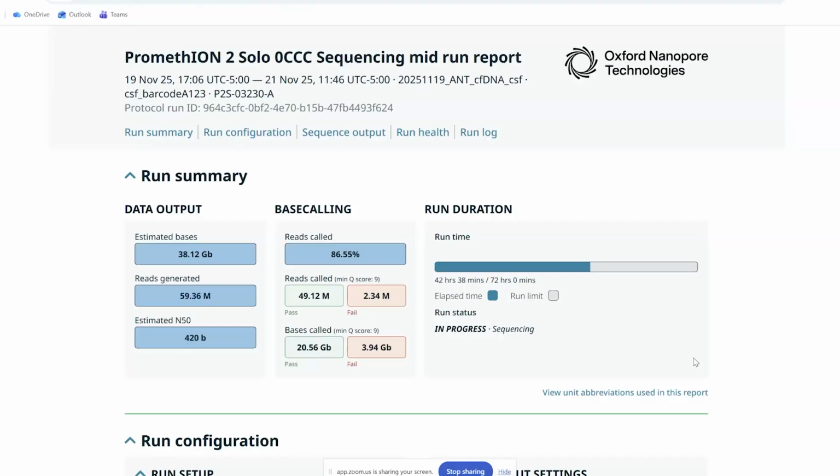But FASTQ is pretty simple and straightforward for concatenation if that's what you're using. You can do it from the command line. You can use FastCat, or you can just use the workflow's ability to concatenate things instead. So you can give it a folder full of BAM files or FASTQ files.